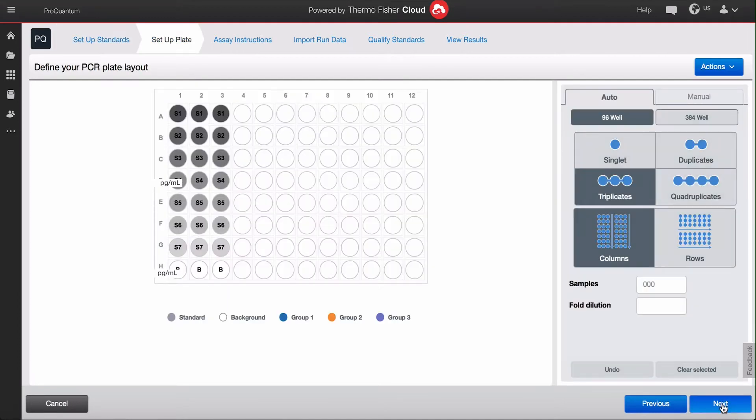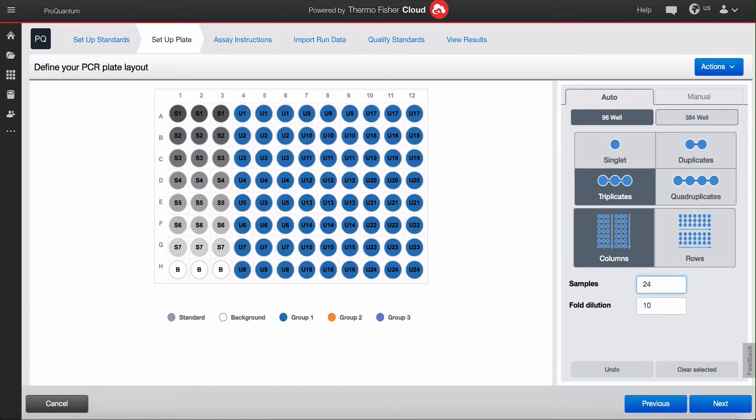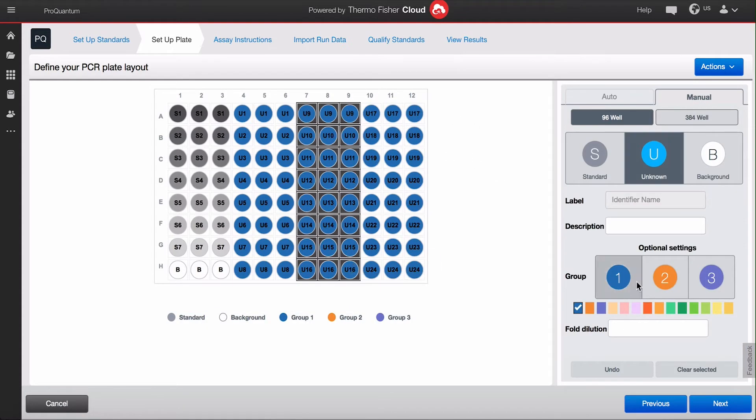Design your plate layout either in automatic or manual mode. We'll show you an example of running an entire 96-well plate with unknown samples in triplicate.